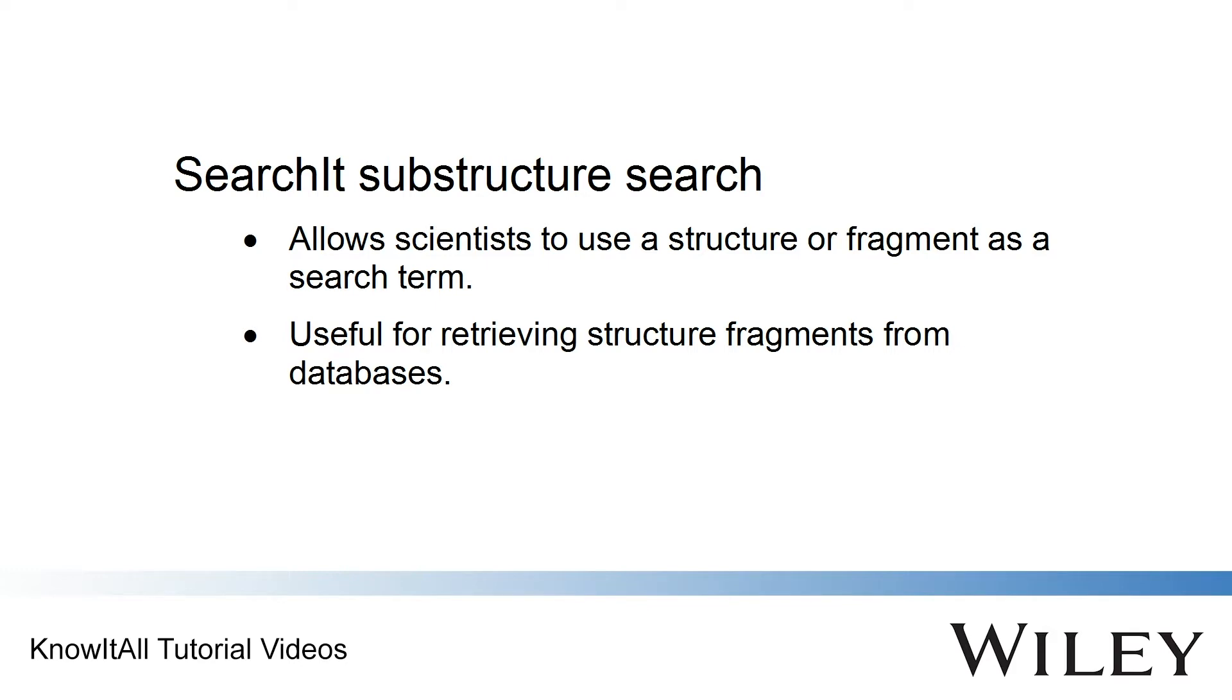This capability is useful for retrieving structure fragments because a substructure search always analyzes the entire molecular structure of a compound, not just the largest fragment.